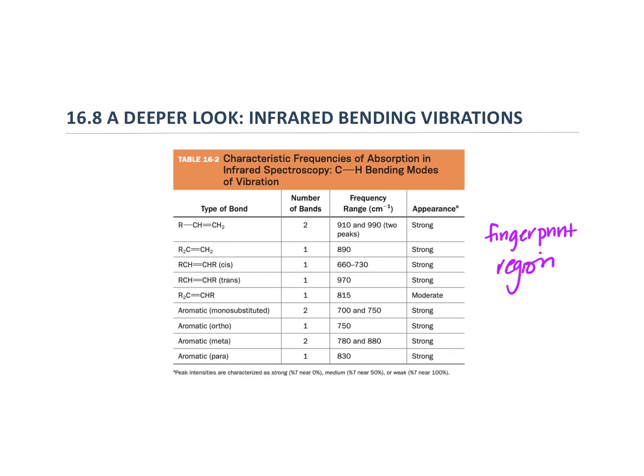Now, these can be useful about a molecule structure, but it's very rare that they're useful. We will not see them at all, really. So very rarely will we see these. We won't use these. If you go on to graduate school, you can, like I said, I use this for one spectra in graduate school to help me identify something.